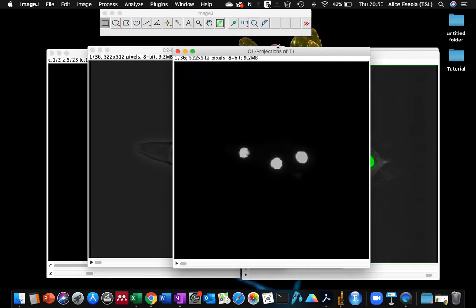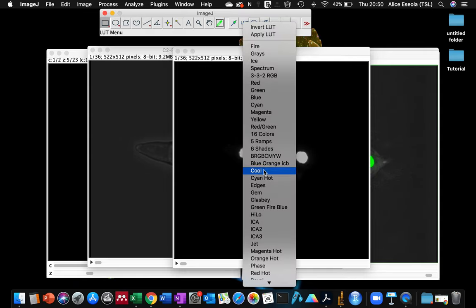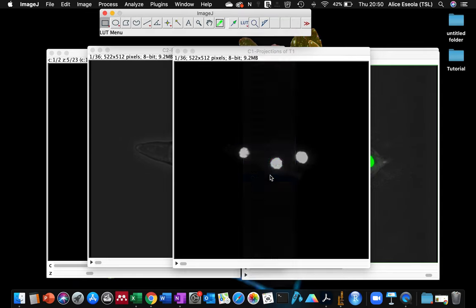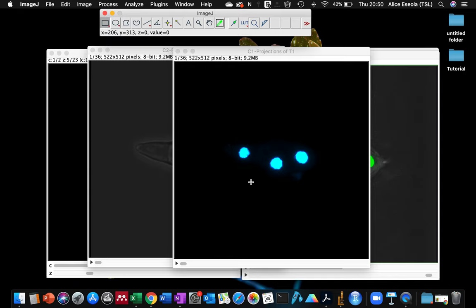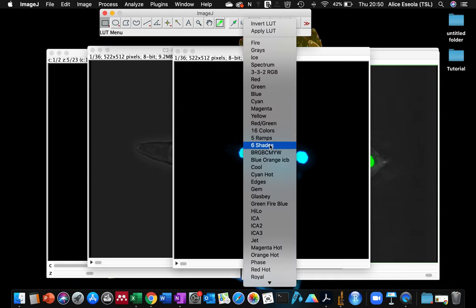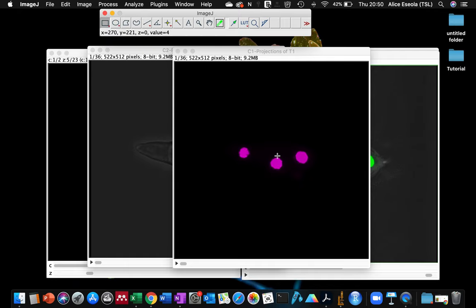I'm going to give this channel a color since it's a fluorescence color. Let's just choose something. Let's make it magenta.